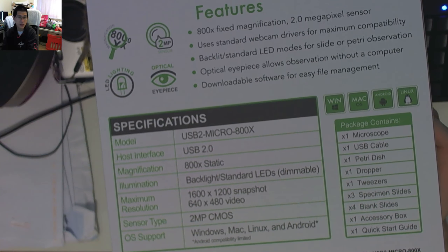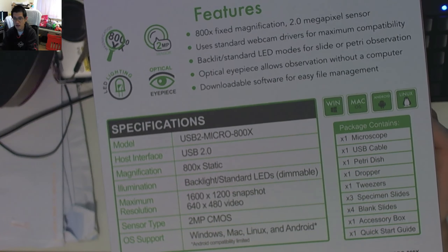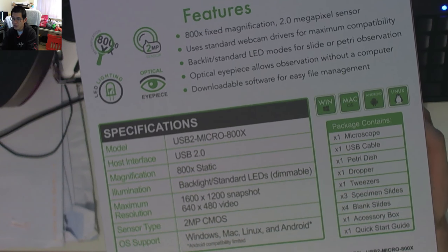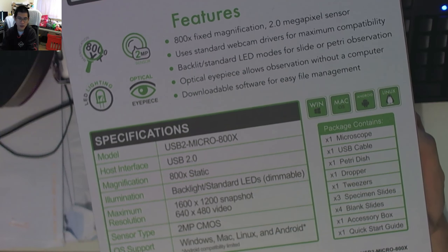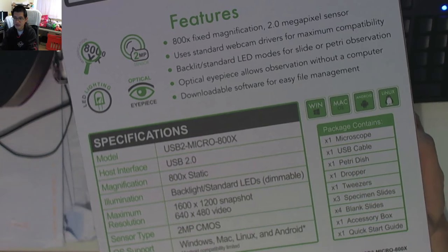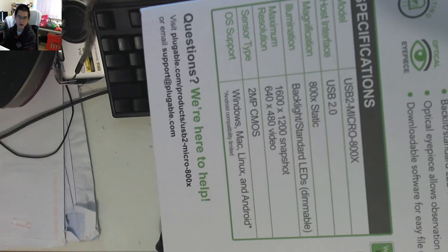There's an optical eyepiece so you can look at it without a computer, and there's some software available. Image capture is 1600x1200 snapshot, which is pretty cool, and VGA-level 640x480 video — nothing too spectacular. The package contains quite a lot: microscope, cable, petri dish, dropper, tweezers, slides, blank slides, an accessory box, and the quick start guide.